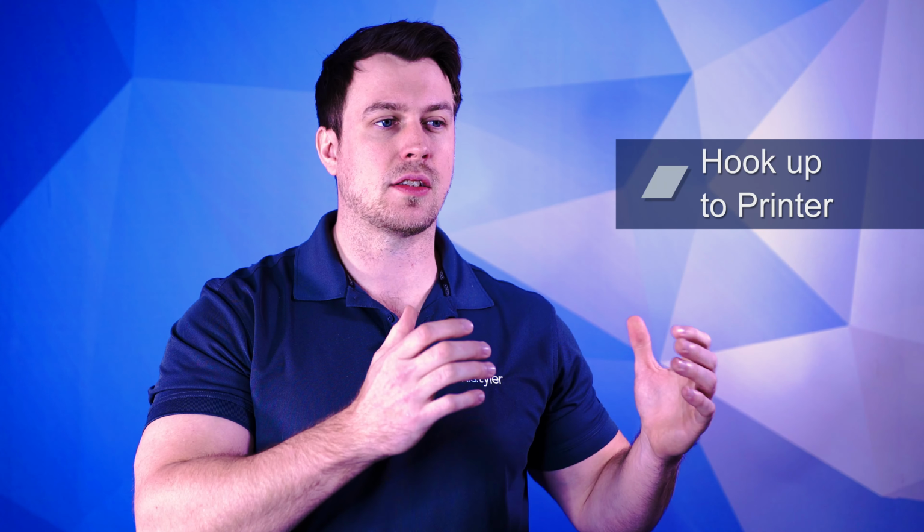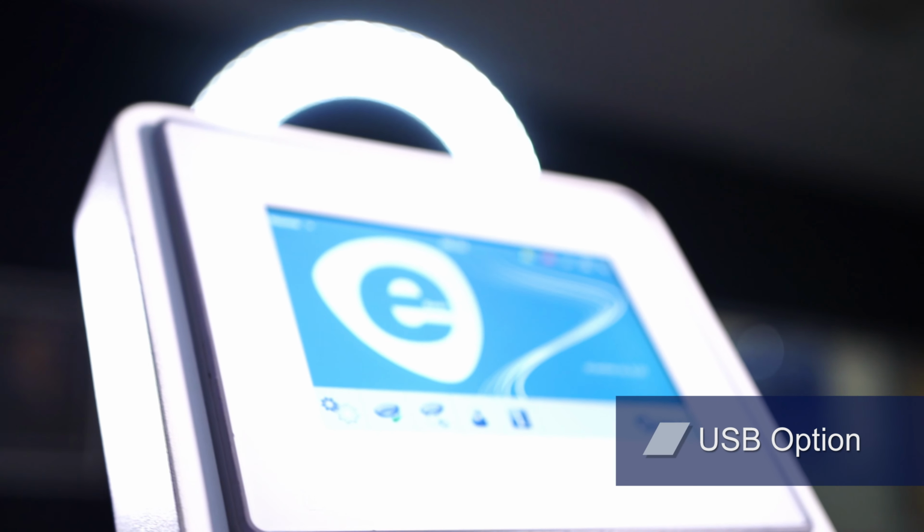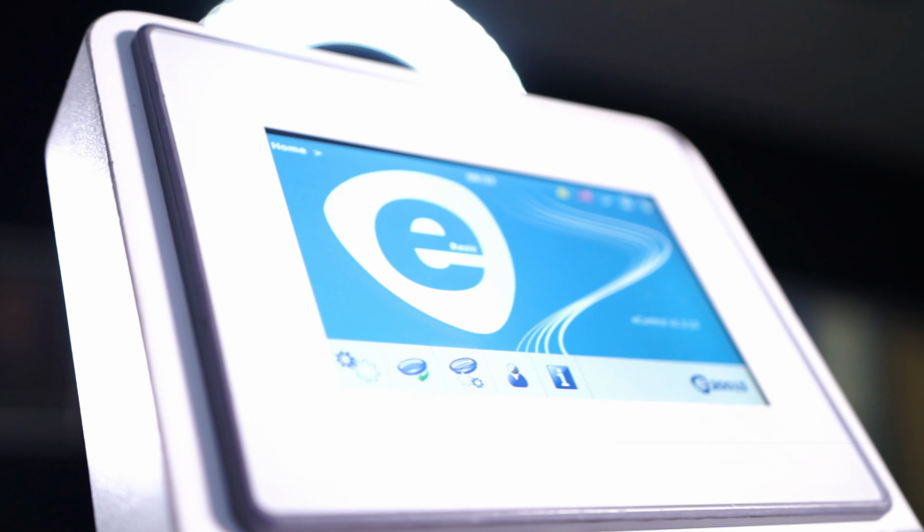Also, you're going to be able to hook it up to a balance, you're going to be able to hook it up to a printer, and you're going to be able to get those tests saved and stored internally, or you can use a USB to pull those off and then put them directly onto a computer. You're going to get charts, but you're not going to get histograms on those charts, just the raw data like you would record with pen and paper. The E200LS Basic runs at about $11,000 to $12,000.